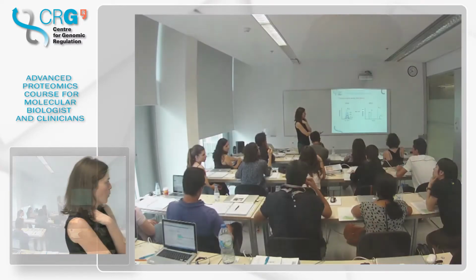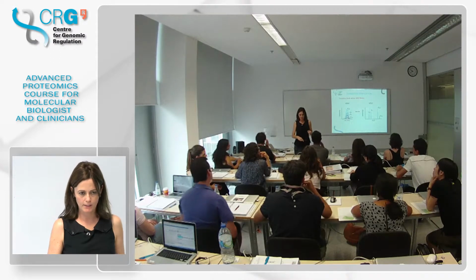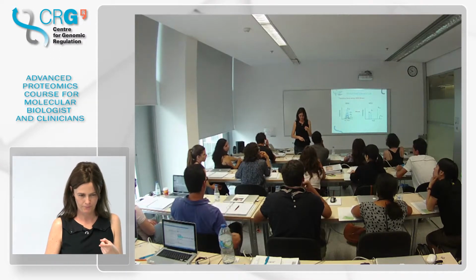I think the question is when you use the transition of the heavy fragment. From your heavy peptide, you have your arginine or lysine, which is the heavy one. Yes. But this one you don't include in your transition list. They will be, because all the Y ions will include that heavy lysine or heavy arginine.